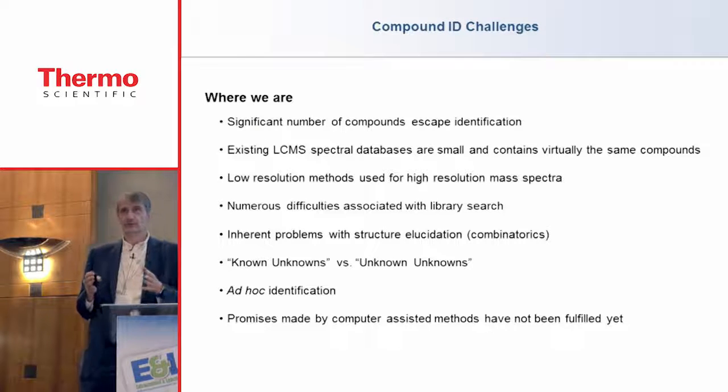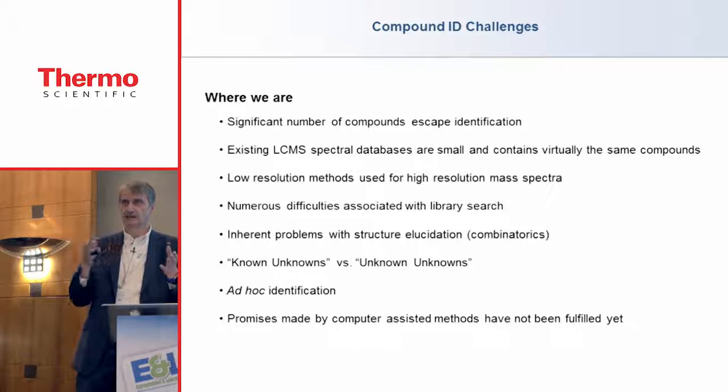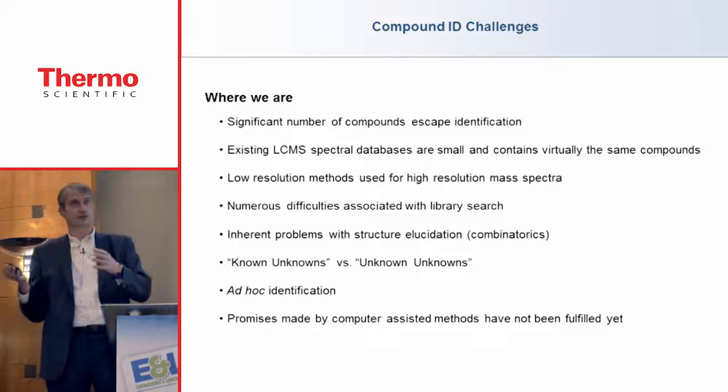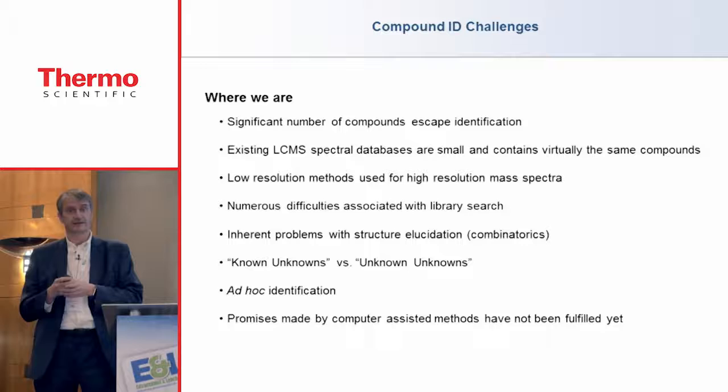This is kind of a paradox because we are hearing every day that there is a Mars rover analyzing the Mars soil. There has been a mass spectrometer on Jupiter falling down. There was a mass spectrometer on a Saturn moon and so on. Why can we not identify the compounds on the Earth? We have the sample, we have all these instruments, so why is it so complicated?